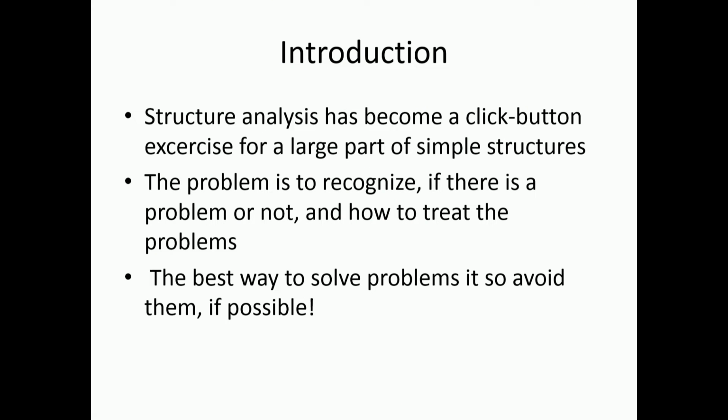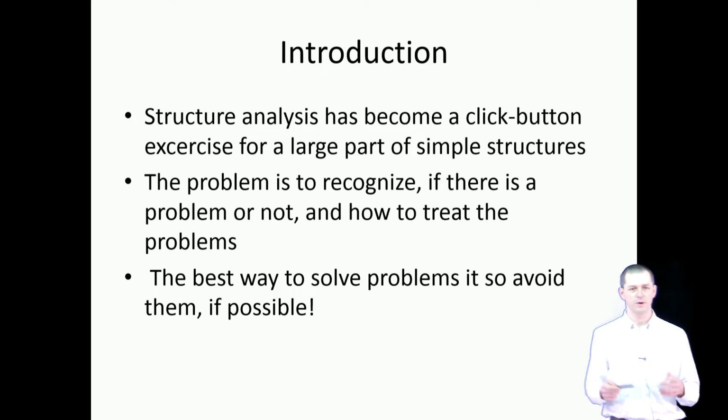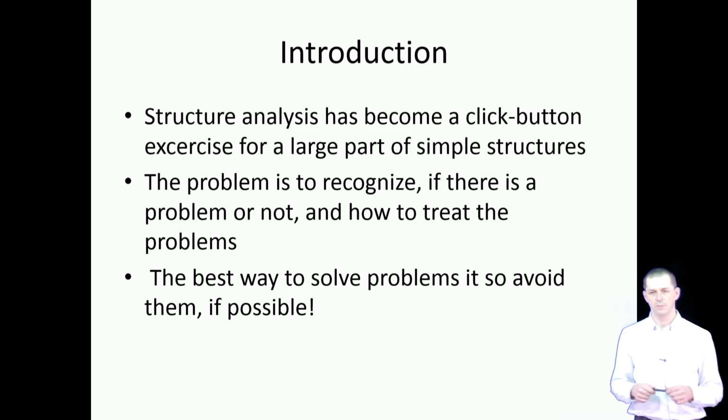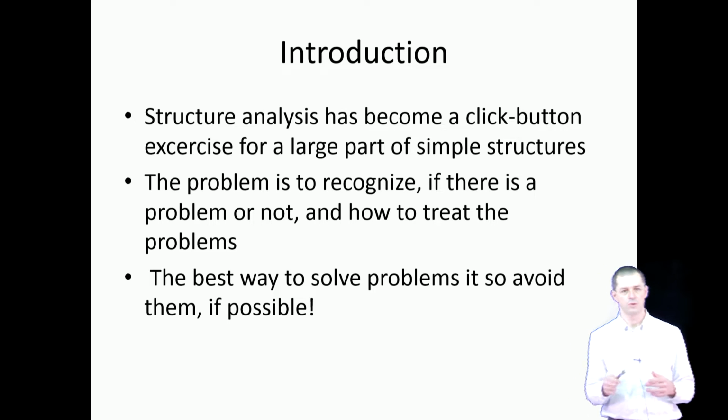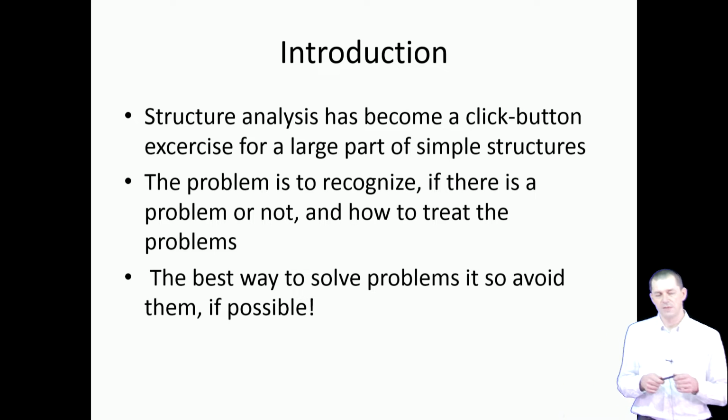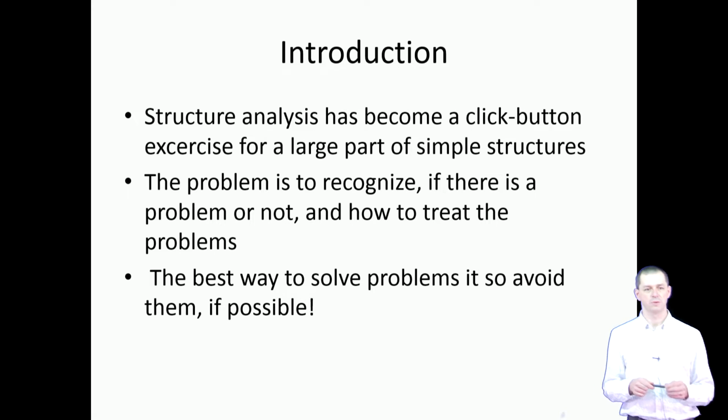So the truth is that for a large part of structures that I call simple, well, what is simple you can say only after the solution. At the beginning, when you have a crystal in hand, you cannot say if the structure solution will be simple or not. But for a large part of crystal structures, the structure analysis has really become a click button exercise. If you know how to use the programs, if you know where to click, how to use the options, you will obtain the solution in essentially a couple of minutes from the moment you collected the data.